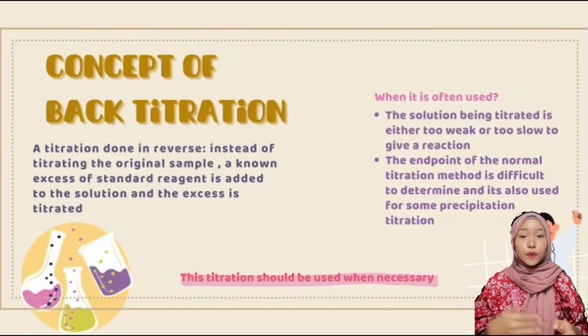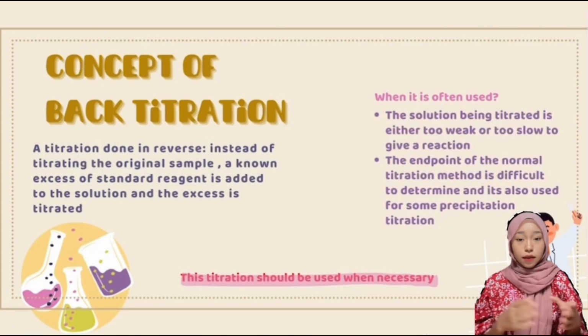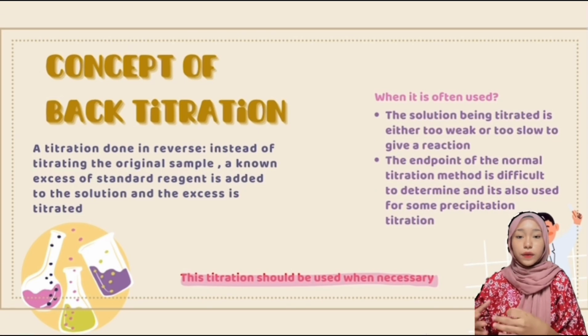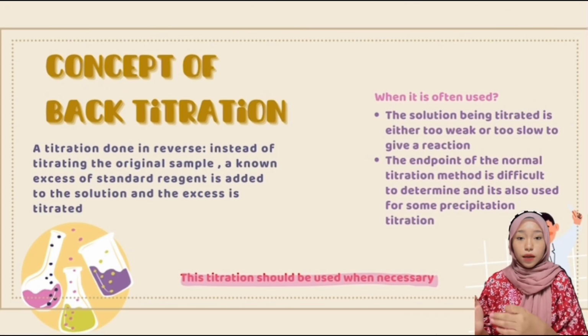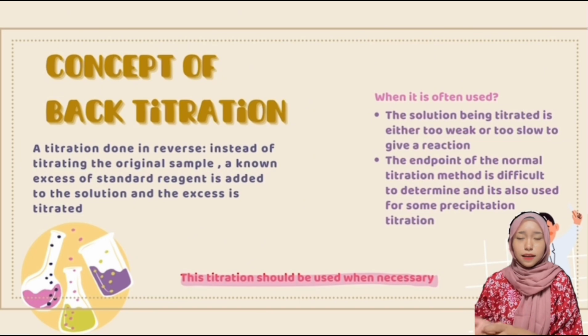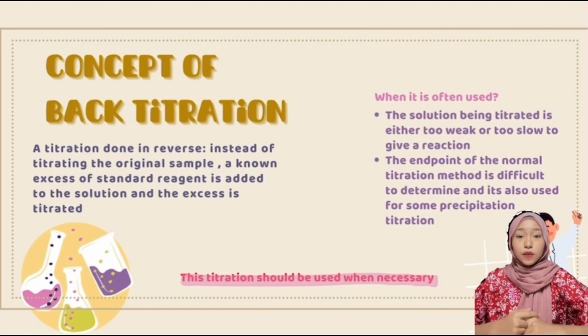So next, we move to the concept of back titration. As we know, back titration is a titration done in reverse. Instead of titrating the original sample, a known excess of standard reagent is added to the solution and the excess is titrated. So when is back titration often used?